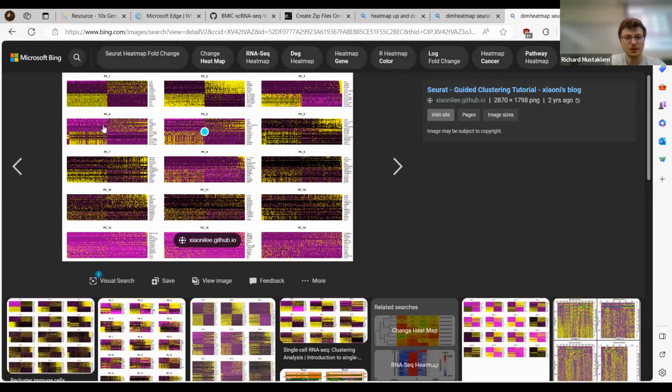PC4, this is when you can probably start considering to cut it off, but by PC 6, I would definitely cut off anything past PC6, because at this point you can't even tell what genes are being regulated in which direction. And each one is case by case too, each experiment has its own reasonings for things, so you don't have to cut it off at 6, but me personally, I would.